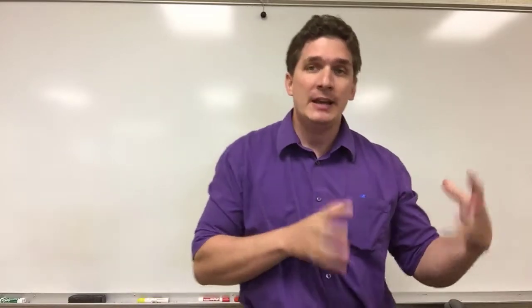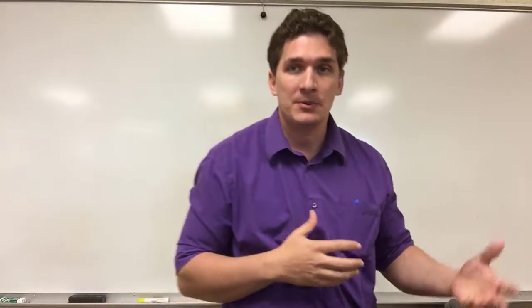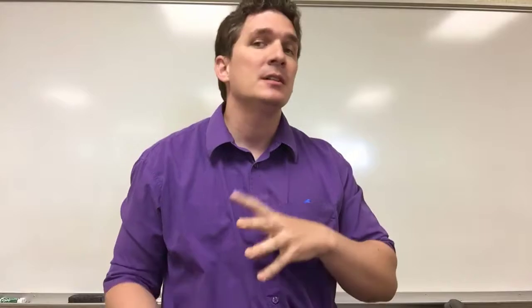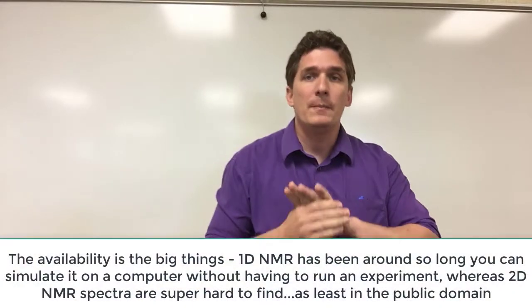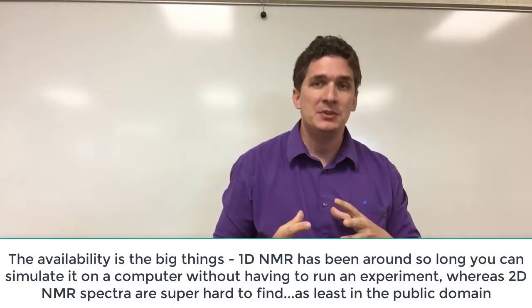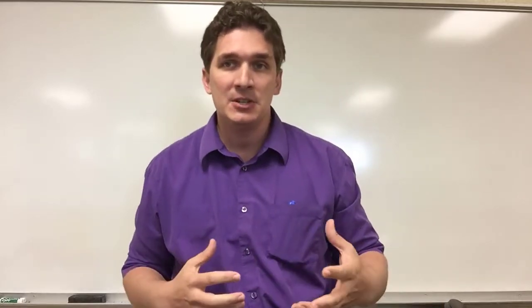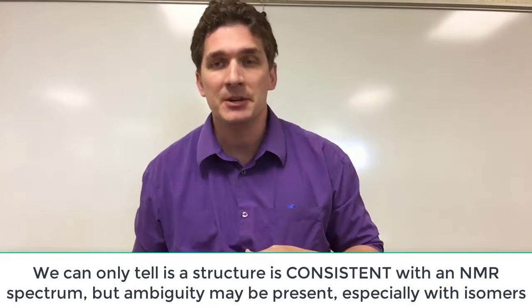So at the organic chemistry level, we typically focus on the 1D NMRs, the carbon 13 and the 1H, because they're a lot easier to run, they're much easier to find, and there is a bit of skill associated with them. Now, that said, the complication with NMR is that a lot of it is guessing and testing. So when we look at these NMR spectra, we're going to start making hypotheses and we're going to test them against the other pieces of information.